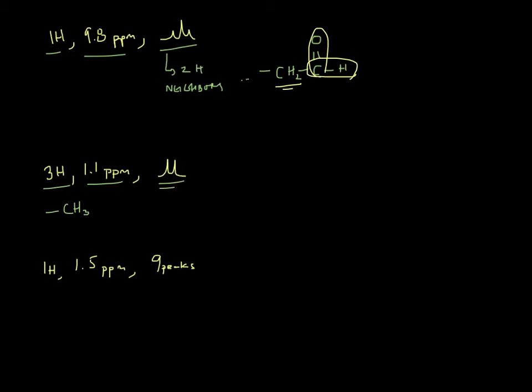We see that we have a doublet. What does a doublet mean? Doublet means that you have 1 hydrogen neighbor. And with 1 neighbor, it means that you must be next to a CH. So this is my signal right here, CH3, but it's got to be next to a CH. That can't be a CH2, it can't be a CH3, it's just a CH, and so it's probably got carbons over here. We can't say that for sure.